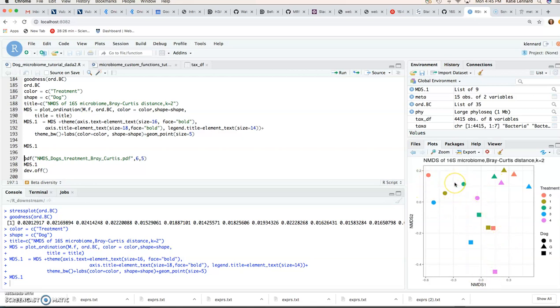So we still see that the dogs and different dog samples for a given dog are most similar to each other. And that we don't really from this see any clustering by treatment. So it doesn't look like treatment has that much of an effect on these dog microbiomes.